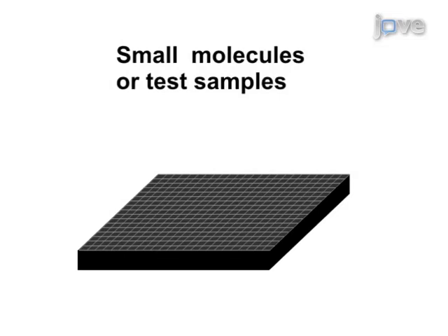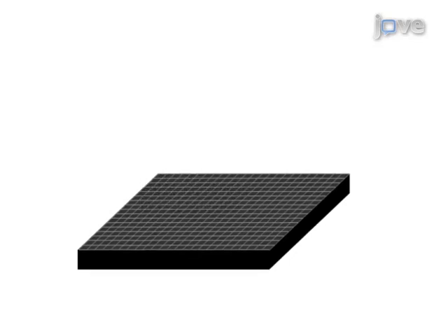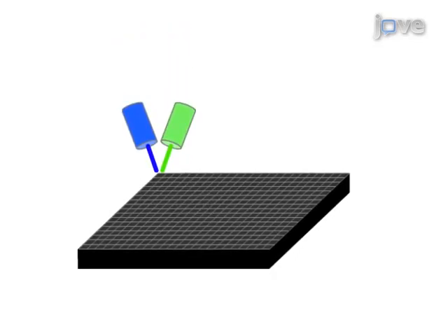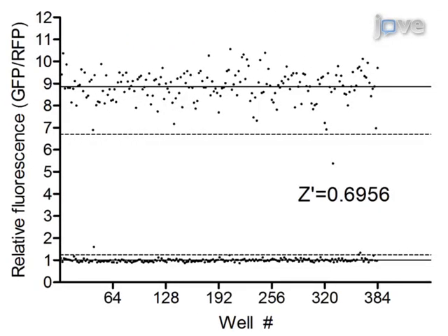Then, small molecules from a chemical library or test samples such as water, food or soil are added to the worms. Finally, the fluorescence of the worms is measured with a microplate reader. Data analysis of fluorescence intensities reveals small molecules that modulate inducible transcriptional pathways or allows for the detection of environmental contaminants.